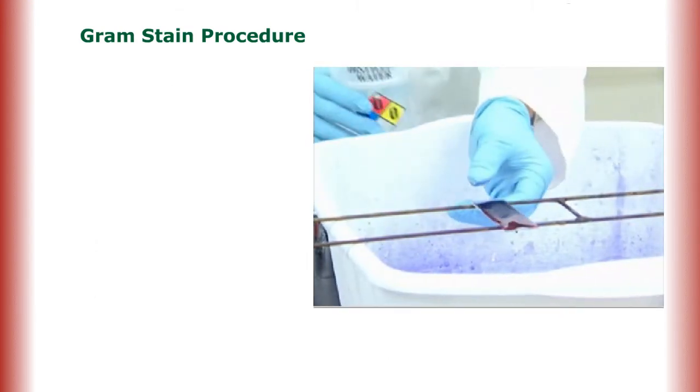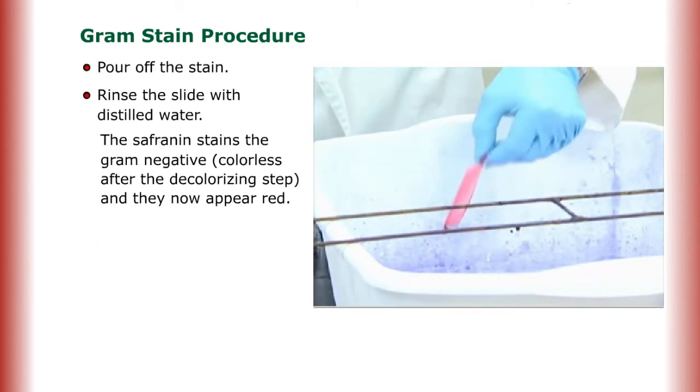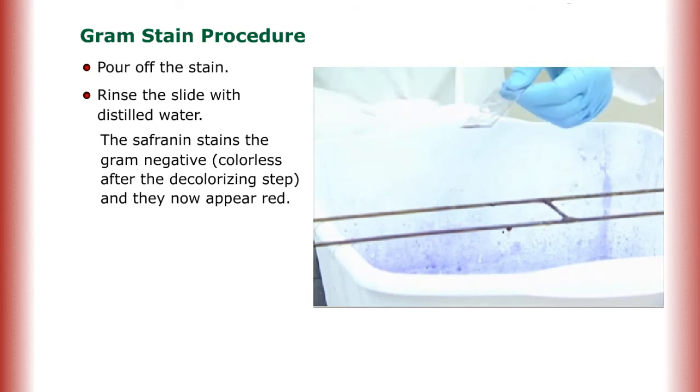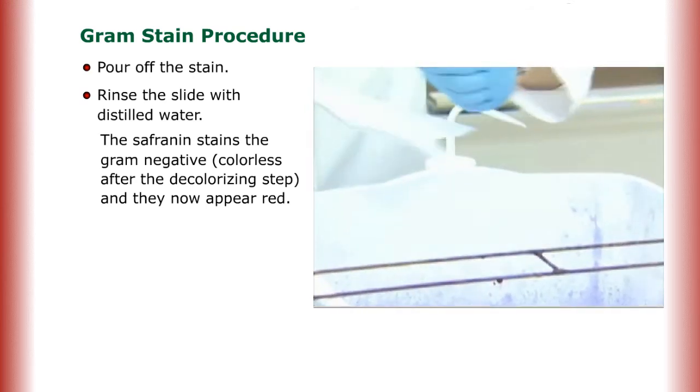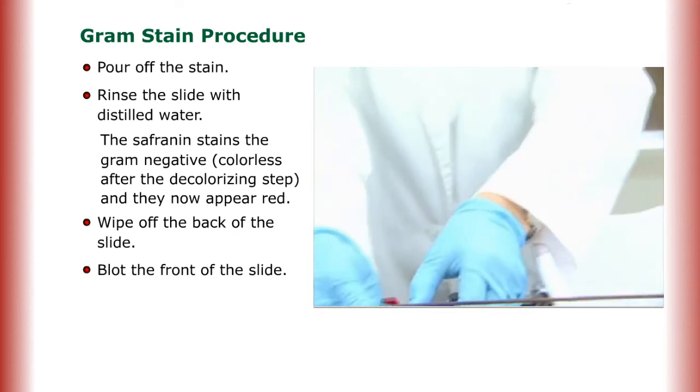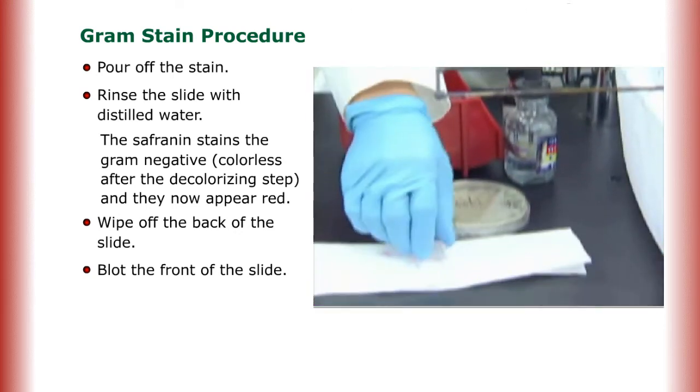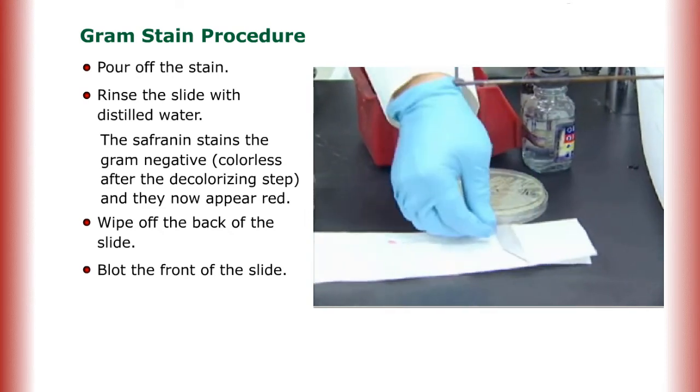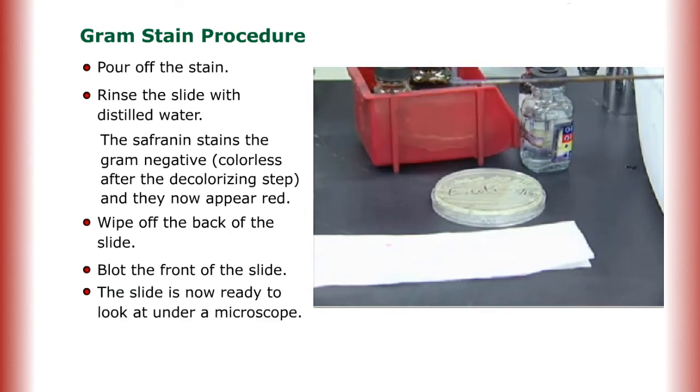After 30 seconds has passed, you pour off the stain, rinse the slide. Again, keep the back of the slide clean. Then you can wipe the back of the slide and you will blot the front so that you will be able to view it under oil immersion of the microscope. The slide is now ready to look at.